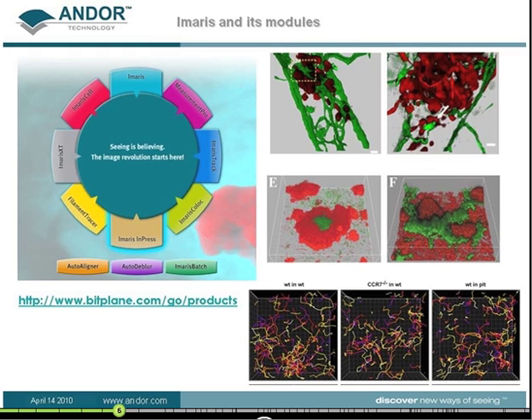So that's a very important aspect of developmental biology at the current time. In the middle area on the right-hand side here, we have another visualization tool, and this one was developed with these examples of looking at biofilm developments. And then finally, at the bottom here, you can see all of these squiggly lines that essentially are identifying individual cell tracks in a study that was, again, looking at development and tracking individual cells. So one could spend many webinars looking at Imaris, but I'm just going to highlight it as a tool for multidimensional image analysis, and probably the world's leading tool.